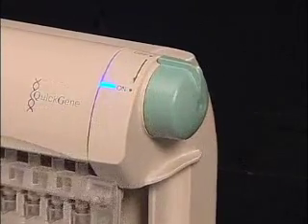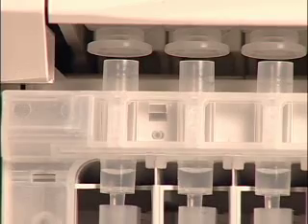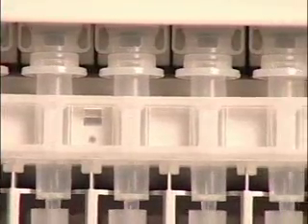Turn the rotary switch to the on position to initiate pressurization. The instrument has eight separate pressure heads that provide a complete seal for full pressurization. With one turn, all eight cartridges can be simultaneously pressurized.